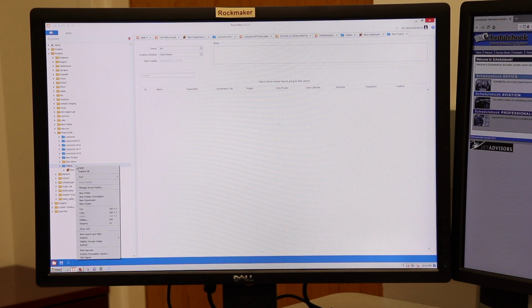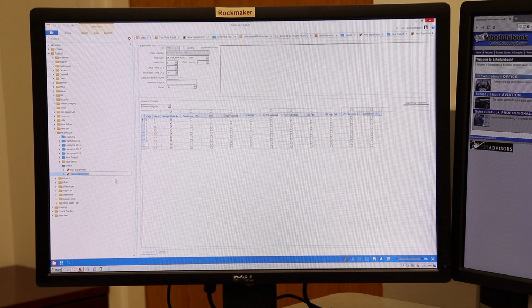On the project, we'll go to New Experiment. We'll give it a name. I usually put the date in the name and the screen.